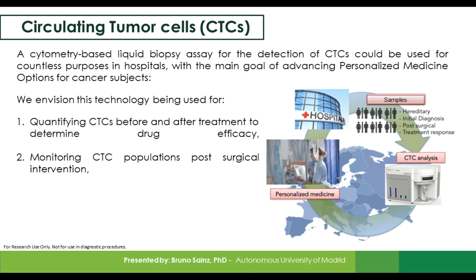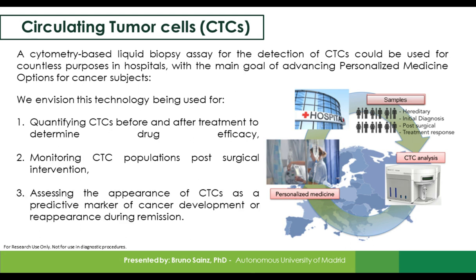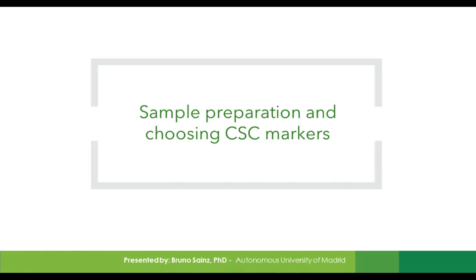We also envision that this sort of platform could be used for monitoring circulating tumor cell or circulating cancer stem cell populations post-surgical intervention, and perhaps assessing the appearance of circulating tumor cells or circulating cancer stem cells as a predictive marker of cancer development or reappearance during remission.